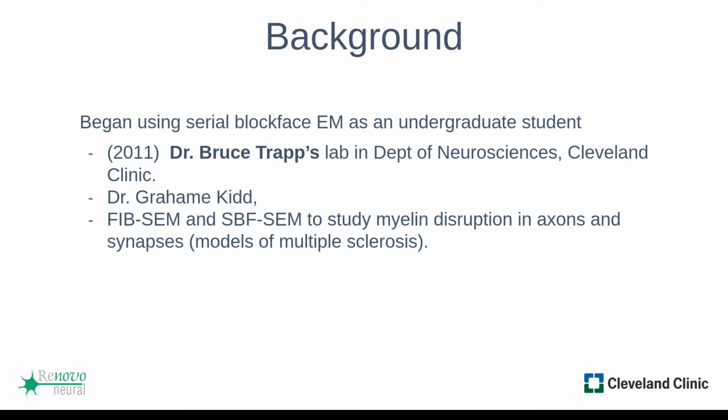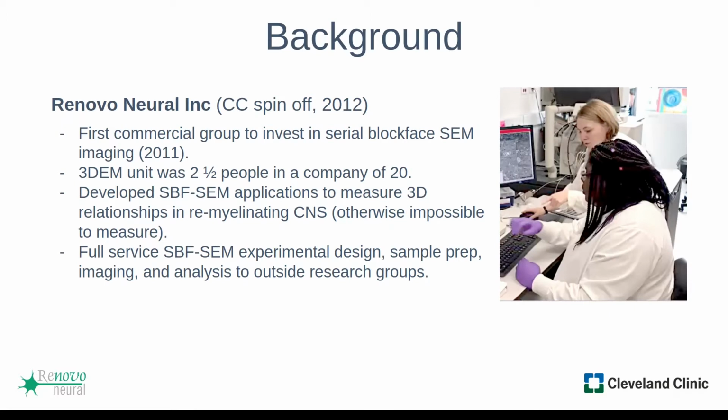The Department of Neuroscience had a spin-off company, Renovo Neural, which invested in a serial block-face system about a year after Bruce Trapp's lab. And this led to me heading literally across the street to work at Renovo on developing and implementing the assays and analysis developed in the Trapp lab for commercial usage there for pharma clients, industry clients, and then we also did academic projects for various people.